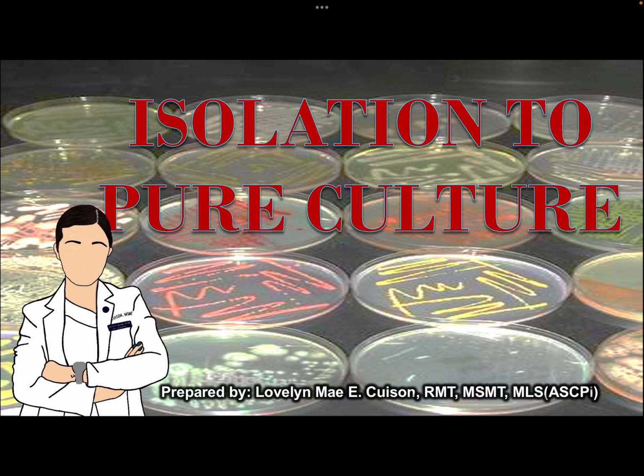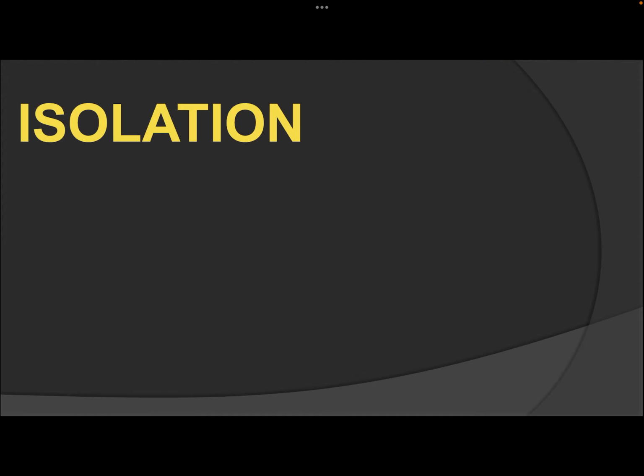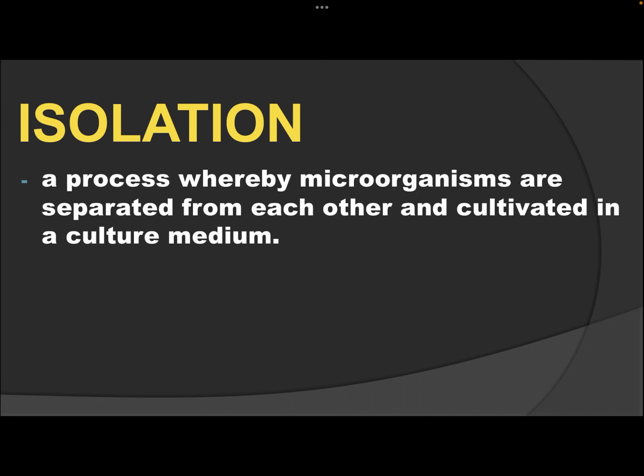Of course, we have the term isolation. That's very easy because that's just referring to a process whereby microorganisms are separated from each other and cultivated in a culture medium. So why do we do this isolation technique?